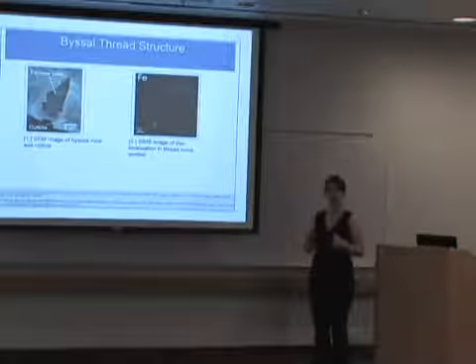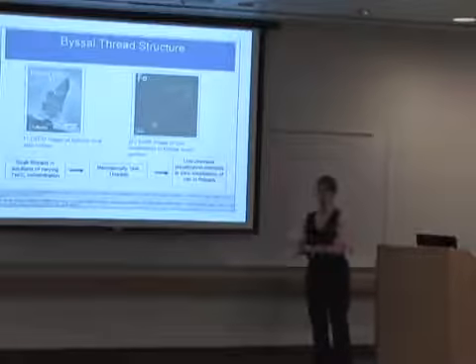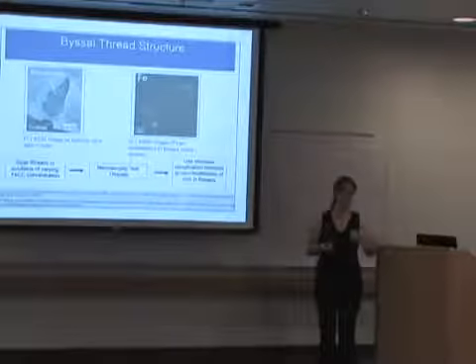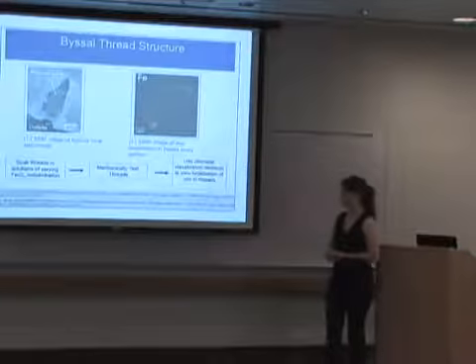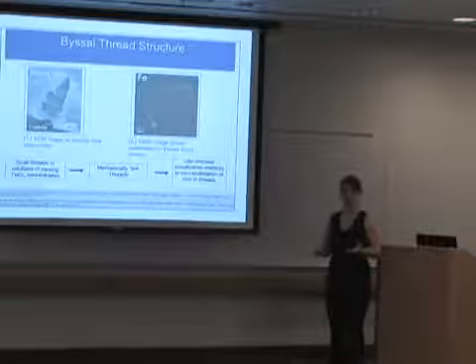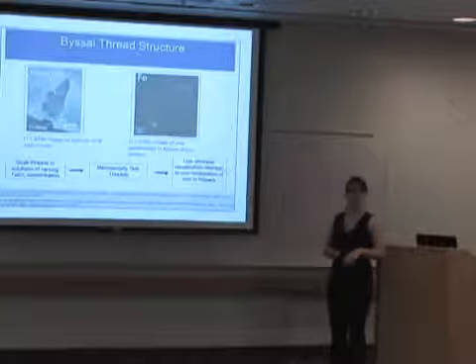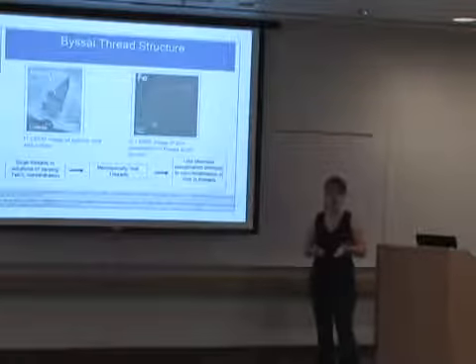So that's what my project was trying to look at a little bit this summer, the role of DOPA-iron bonding in the cores versus DOPA-iron bonding in the cuticles as you increase the amount of DOPA-iron bonding that's taking place. So the way I did that was by soaking threads in solutions of different iron trichloride concentration, mechanically testing those threads to establish a correlation between thread mechanical properties and increasing iron-DOPA bonding.